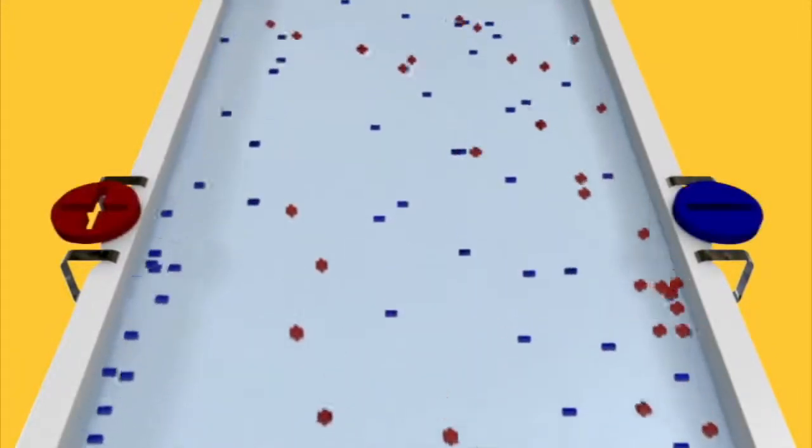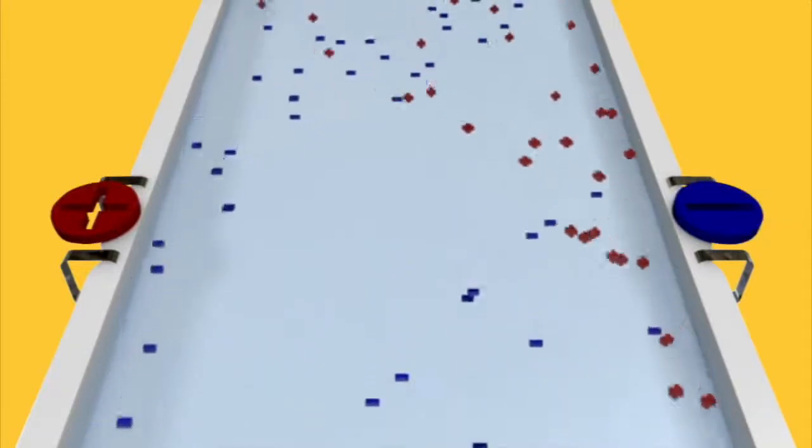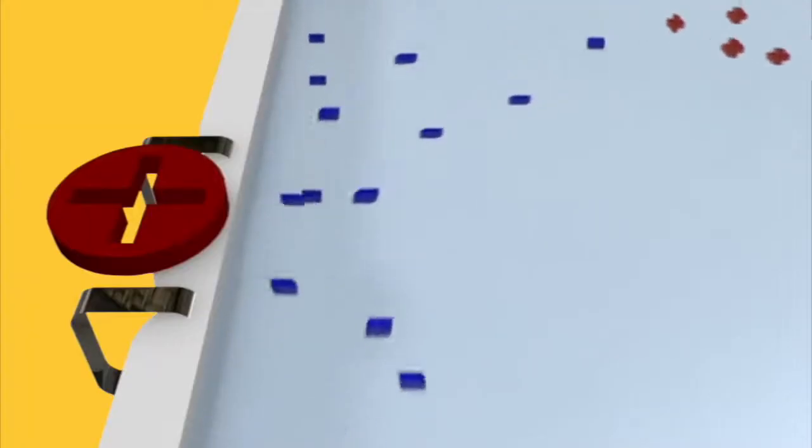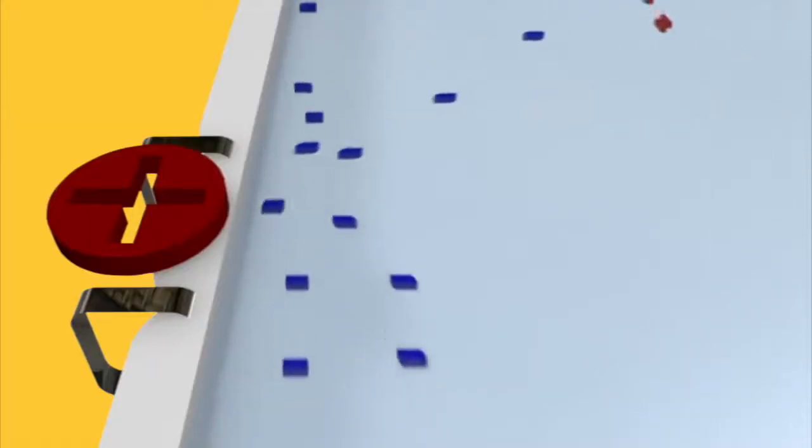Electrodes are placed on each side of the water flow, and a small electrical field is applied. This causes the positive ions to migrate toward the negative electrode and the negative ions to migrate toward the positive electrode.